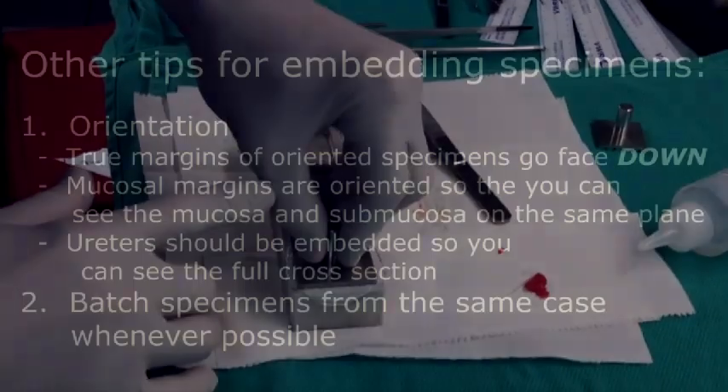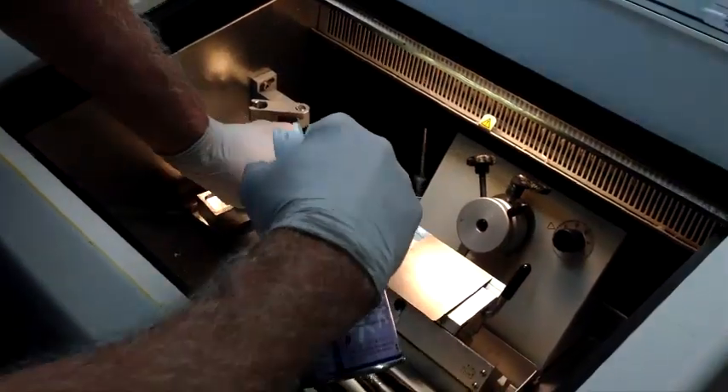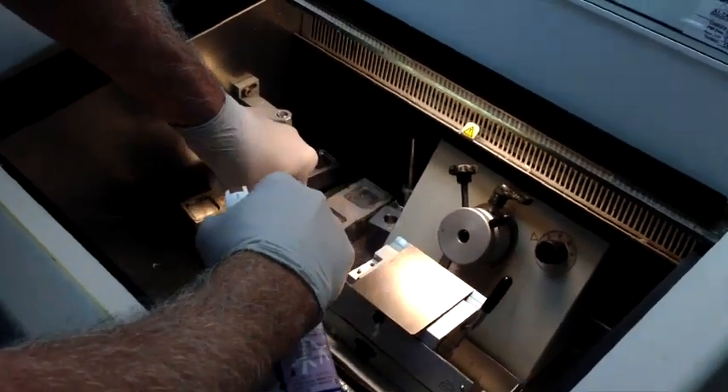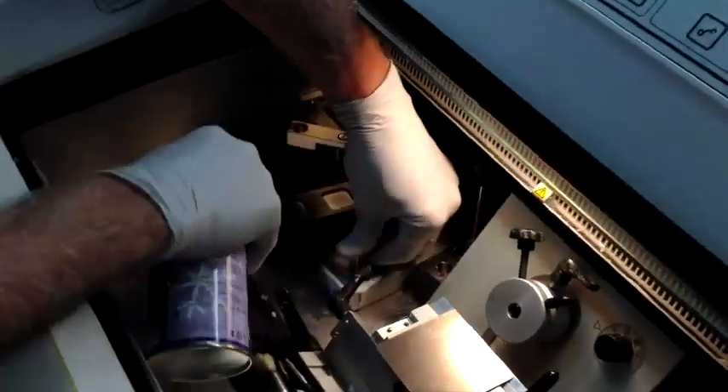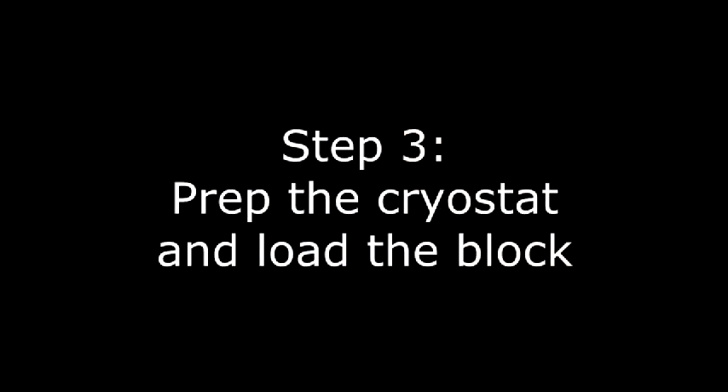I press it down firmly, then bring this over it and put it into the cryo stick. Hold this down and spray. If you spray it, it will freeze a lot more quickly than just letting it freeze by itself.